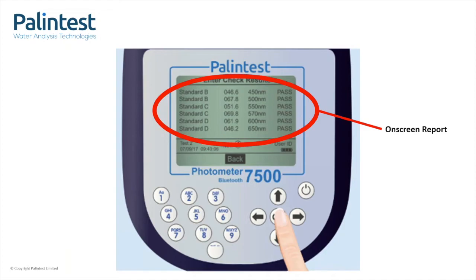This makes it easy to input the values on the certificate into the memory of the instrument. Then, each time you run the check standards through, you don't need to refer to the certificate. The instrument already knows the values and tells you whether it has passed or failed on each wavelength. It then displays an on-screen report.